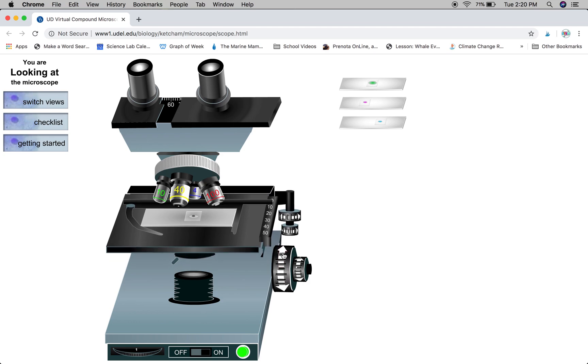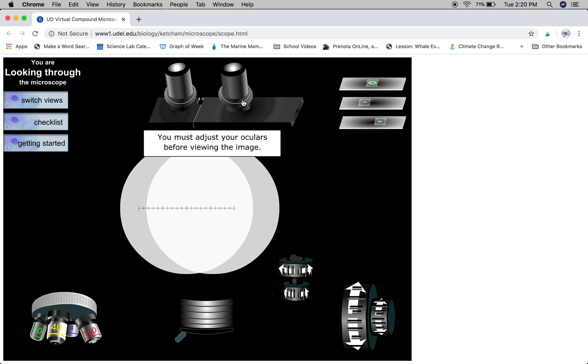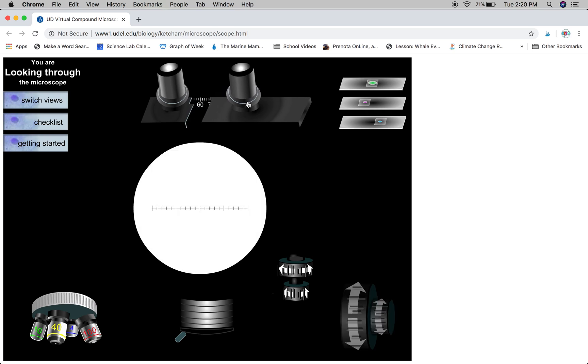Then you're going to move the stage all the way up using your coarse adjustment knob. Once you've done that, you're going to switch views and adjust your ocular so you only see one image, just like so.